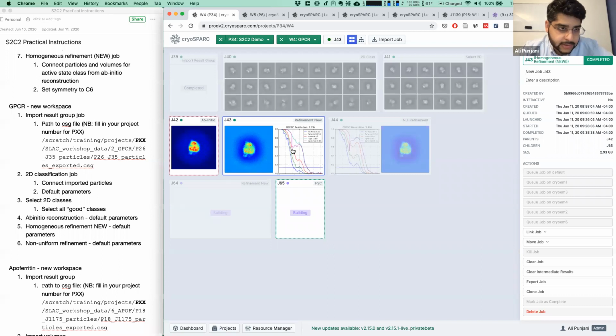With one caveat that we'll be discussing in the next section, 3D variability. Non-uniform refinement doesn't have a lot of interplay with this issue. It has the same exact characteristics in terms of symmetry as a standard refinement, which is that if you enforce the symmetry, there will definitely be symmetry in the output. And if you don't, you will have much less signal to deal with. But I'll just say shortly what I'll be saying later in more detail. What you can do is refine the structure with symmetry to get the highest resolution you can, and then use 3D variability to separate the symmetric and pseudosymmetric conformational changes, which can be detected with that method that I'll show a little bit later.